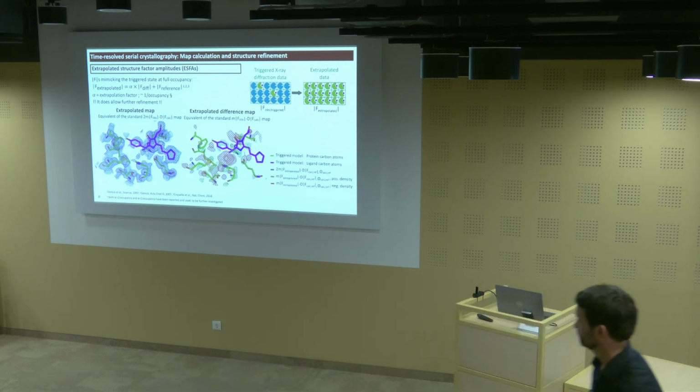It's quite some work that we need to do, and it's definitely on our to-do list to really find the relationship between the extrapolation factor that we found and the real occupancy in the crystals. But with Extrapolate, we report the occupancy with this factor. If you have reasons to believe that there should be another relationship, you're of course free to use it. But this is definitely on our to-do list to really dig into much deeper, because it's important that we report the most probable occupancy. This is quite some work, though.